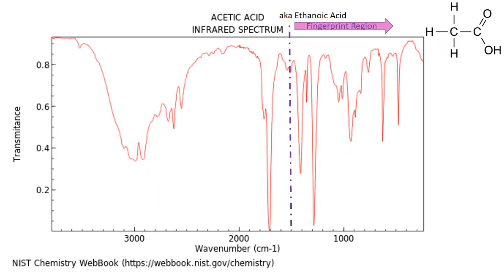So we're now going to look at ethanoic acid, and I've put the display formula up in the corner again so that we can see what functional groups we are going to be looking for in the spectrum. And that C=O and that OH bond are probably the two main ones we're going to focus on. Again, our fingerprint region I've highlighted, and I'm going to largely ignore that. Although it's very distinct for the compound, it's very difficult with our reference numbers to pull out anything useful.